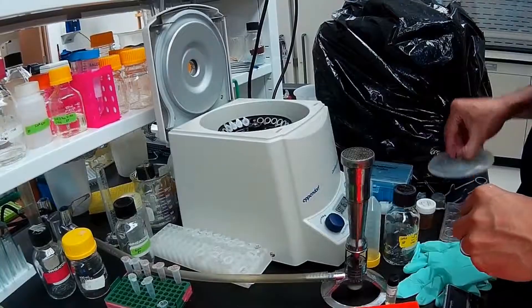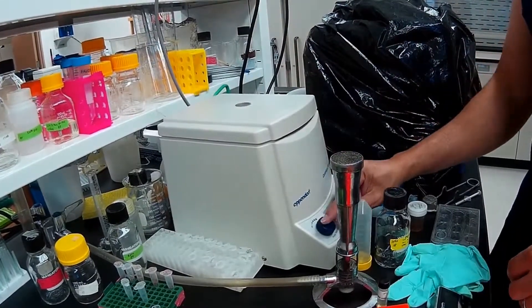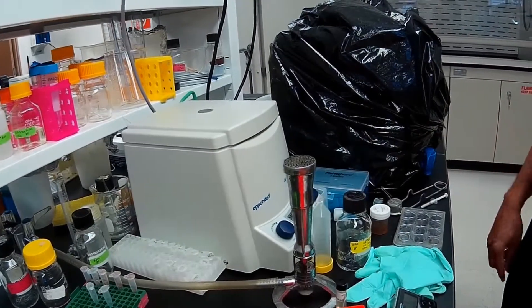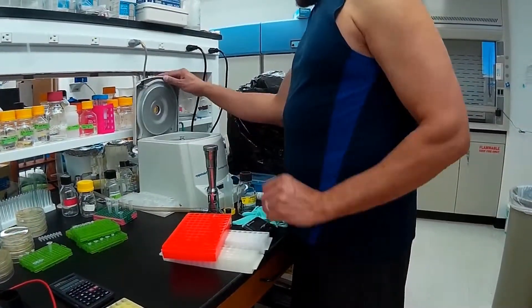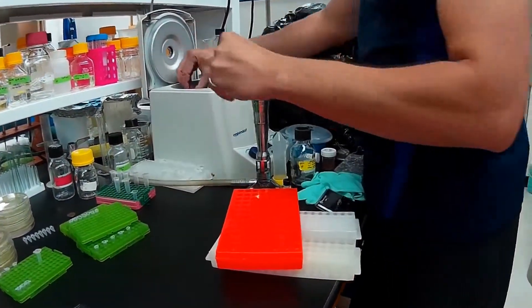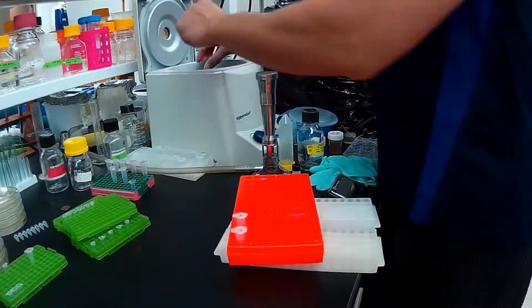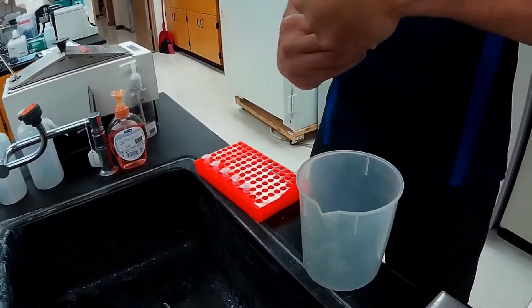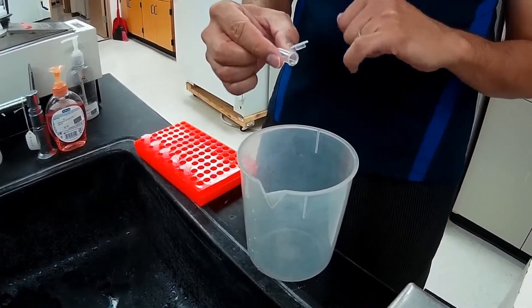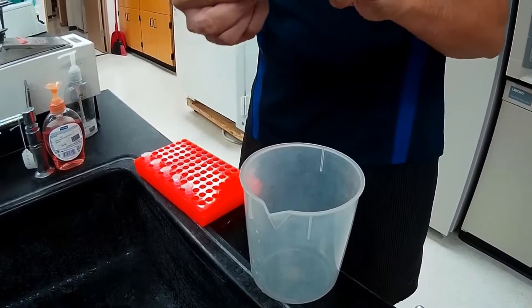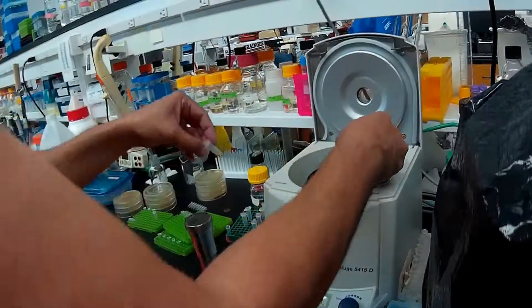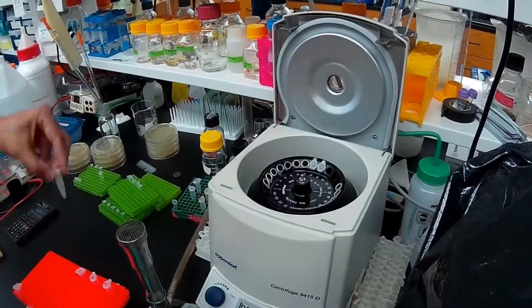I'm going to give a very brief spin, just to collect the 70% ethanol in the bottom of the tube. It can be just five to ten seconds. Discard the 70% ethanol and close the tube gently.